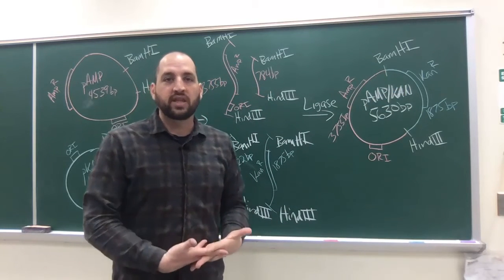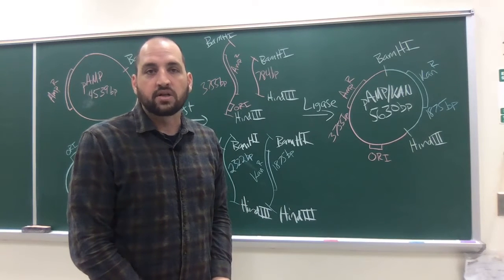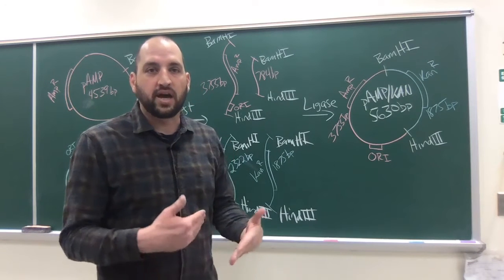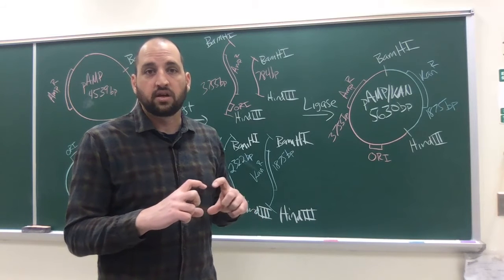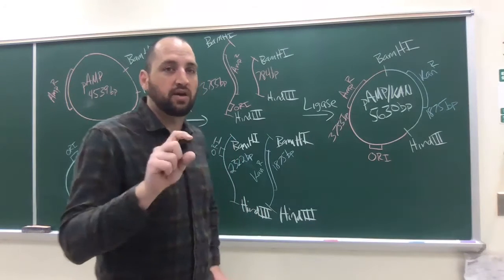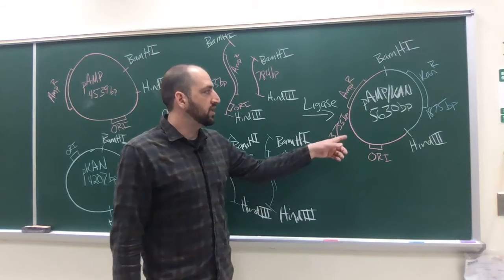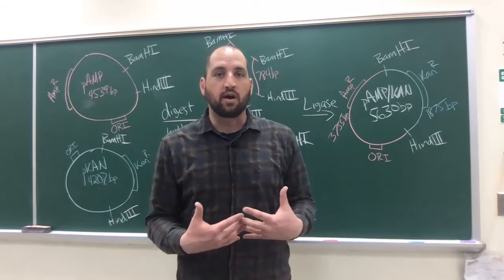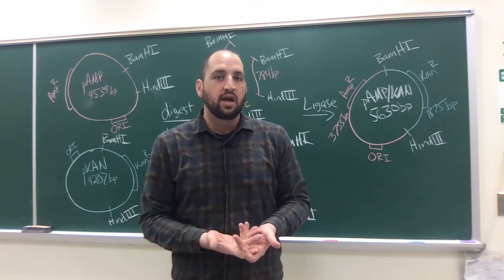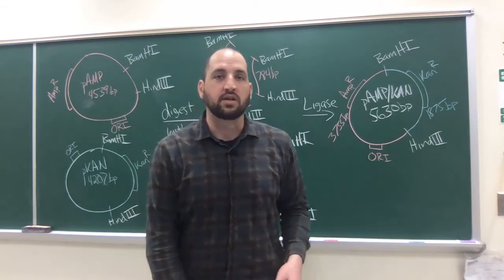If you remember, we left our ligations at room temperature for several hours. We left them overnight. So when you came into this lab, you had a tube with your ligation mixture already present. What we're trying to do today is take our plasmid and insert it into bacteria. Before we can insert plasmid into bacteria, we first need to make that bacteria competent to accept the plasmid.